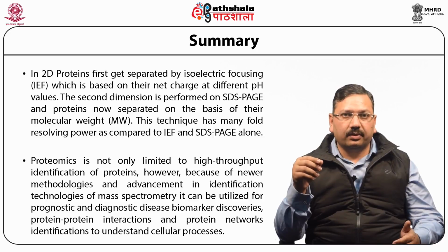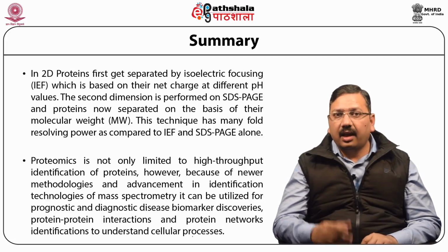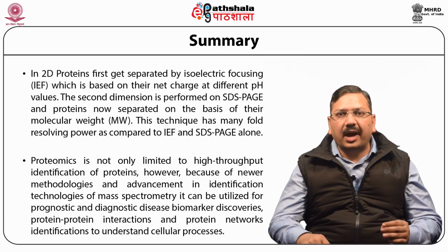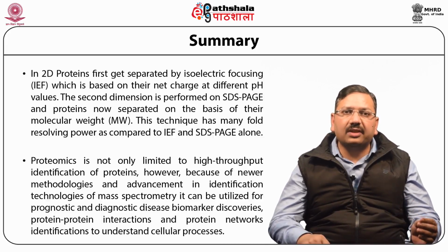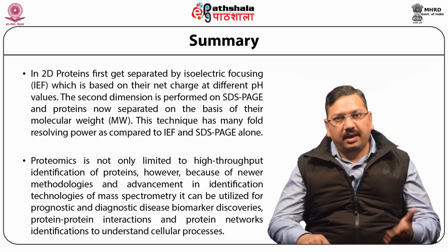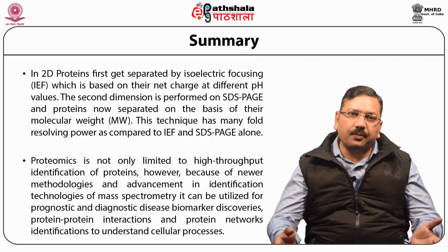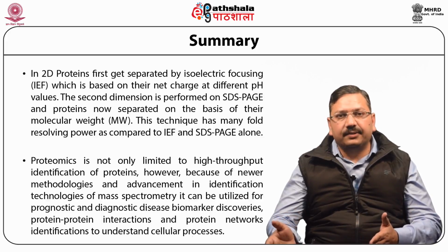In gel-based proteomics, proteins are resolved on gels, preferably polyacrylamide gels, and thereafter identified using mass spectrometry. There are multiple modifications in these biochemical separation methods according to the need. For example, one-dimensional gel electrophoresis, which comprises SDS-PAGE, native PAGE, acid-urea PAGE, or isoelectric focusing, and two-dimensional polyacrylamide gel electrophoresis, basically blue native PAGE, 2D difference gel electrophoresis, or 2D-DIGE.